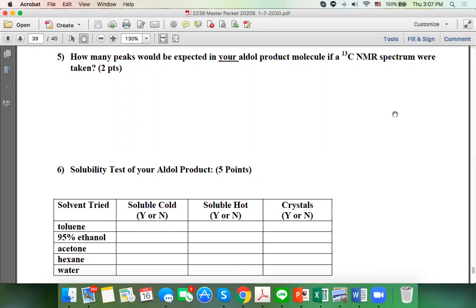You don't want a powerful solvent that will chew up the solid at room temperature, okay? Aaron gets 1 point because she was quickest, okay? Offering this great answer. Yes, you don't want a powerful solvent. You want a very mediocre one, okay? It does not dissolve at room temp, but it will dissolve your solid completely at boiling temperature. And then when you cool down, yes, when you cool down, you will see the pure crystal form. Okay? Very good. Aaron gets 1 point.